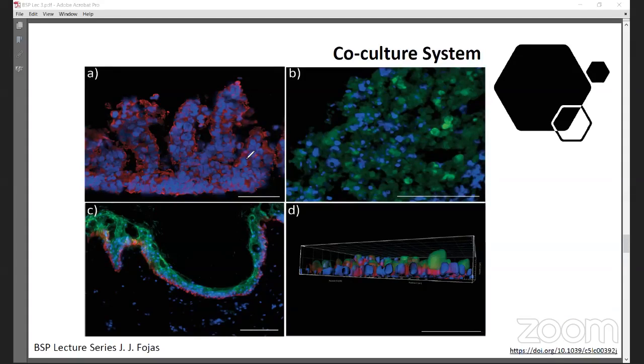That's the main purpose of your BOCs, mostly over the entire co-culture period. And then the skin biopsies reveal a fully functional, proliferative and differentiated epidermis, as your staining would show. And then you have the culture at a physiological air-liquid interface that facilitates the maintenance of your stratified stratum corneum. So that's providing your in vivo architecture for topical substance administration.